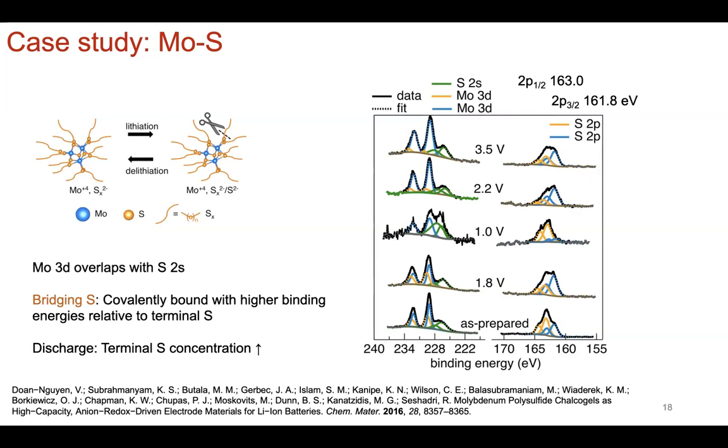Yes, you see this noise? The answer is yes. In terms of difficulty, these signals were collected by putting the powder sample down, and then there's a tamper where you can pat down the powder and get it as flat as possible.